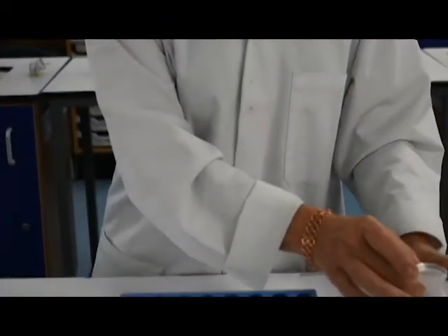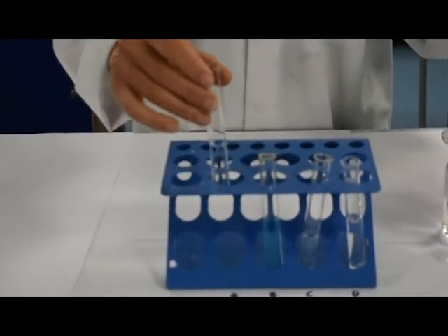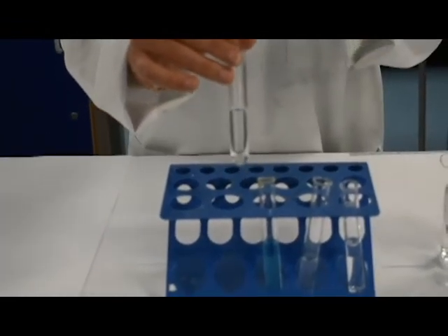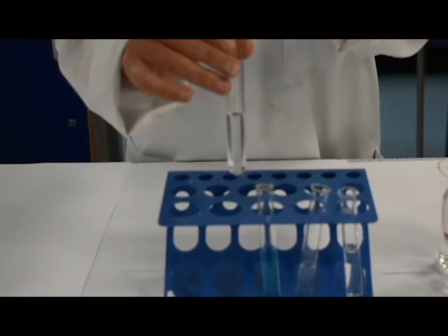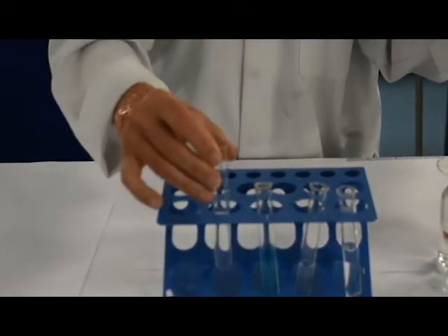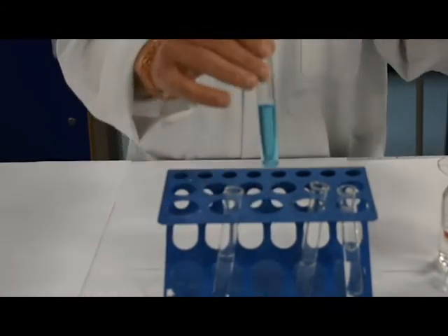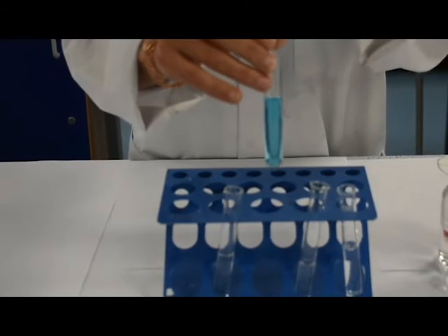Hi, my name's Julia and I'm one of the chemistry teachers here at QE, and the test I'm going to do is the test for an acid using sodium carbonate. So we're going to use sodium carbonate solution, and first test tube is test tube A. Pop a whole pipette full in, give it a shake. Record your observations.